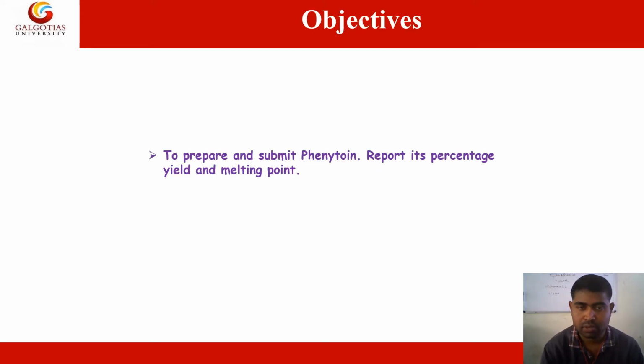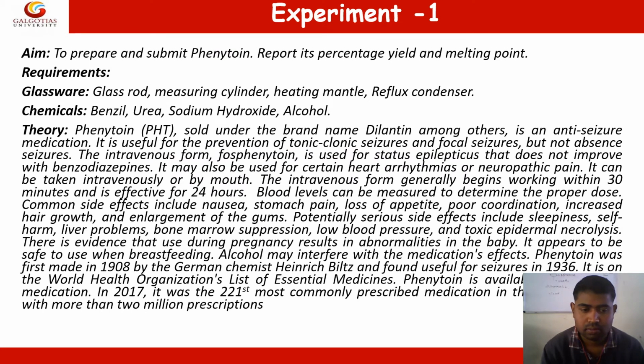So what is today's objective of this presentation? It is to prepare and submit Phenytoin and report its percentage yield and melting point. So let's do it. So today's experimental aim is to prepare and submit Phenytoin and report its percentage yield and melting point.